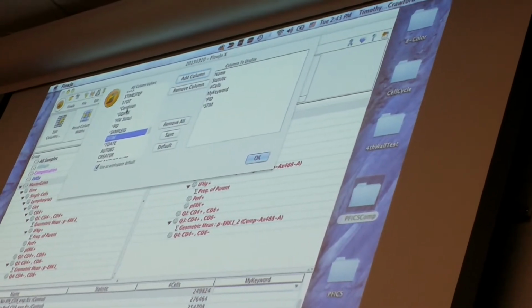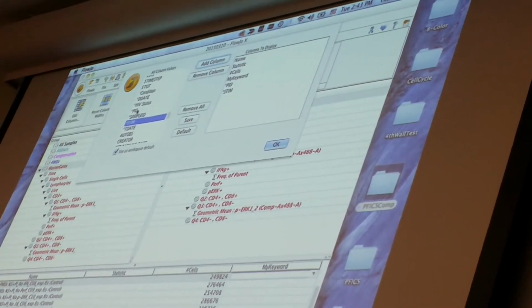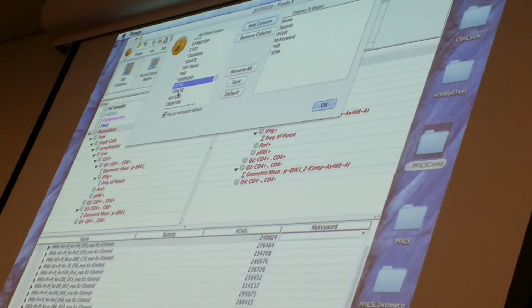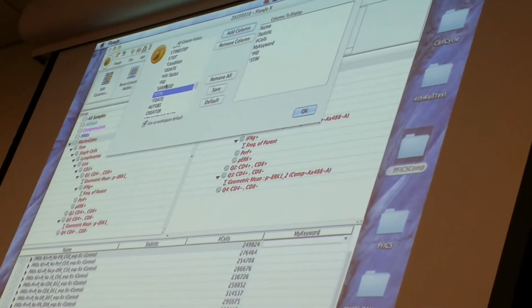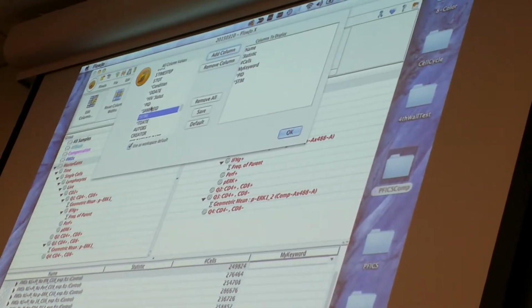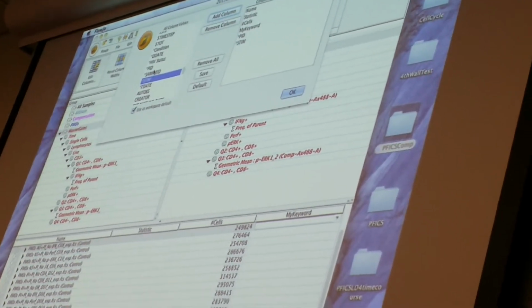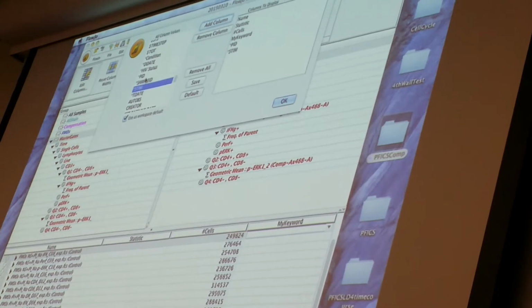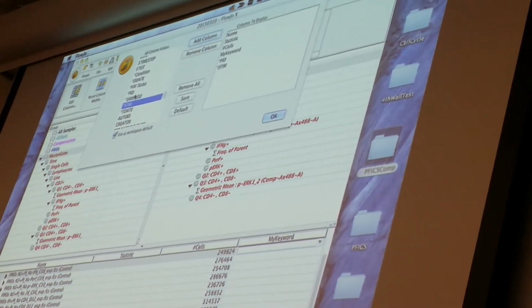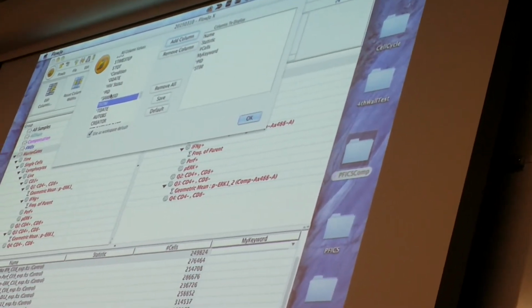I also have things like the draw date, the HIV status, the sample ID, which might be distinct from the patient ID because it includes the date and time of draw, and the thaw date of my samples. All of this information is necessary for me to get back to the spreadsheet with my viral loads and CD4 counts and other clinical data that I want to correlate to the functional responses of the cells. And so the more information you can put to annotate your files on the front end, the easier it's going to be for you to manipulate and organize your data on the back end when you do your analysis. That's my pitch for using good keywords.